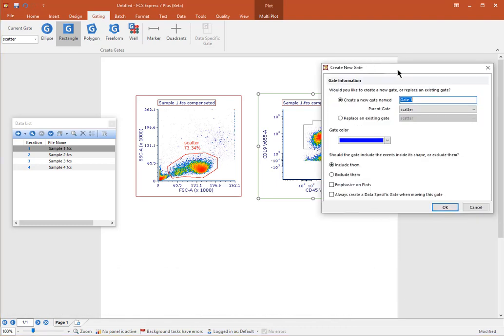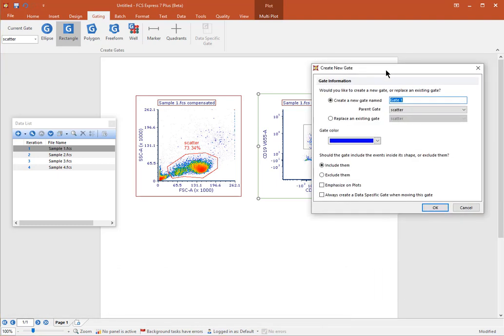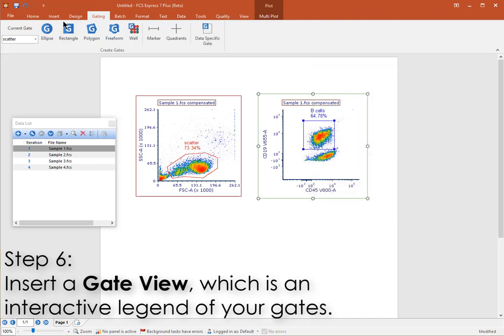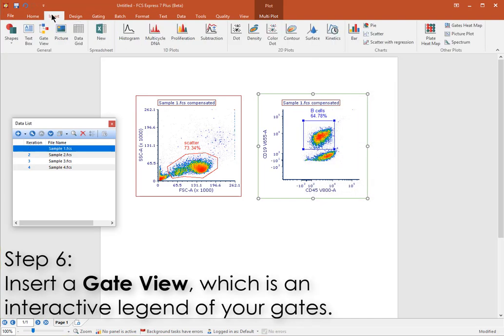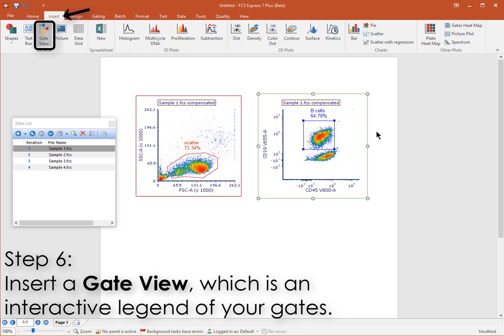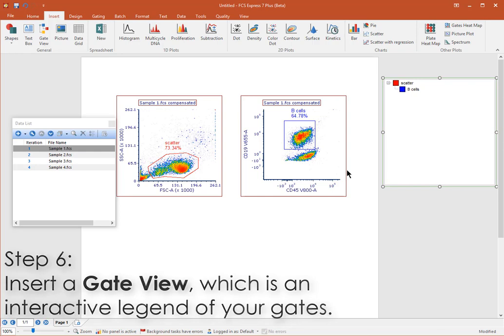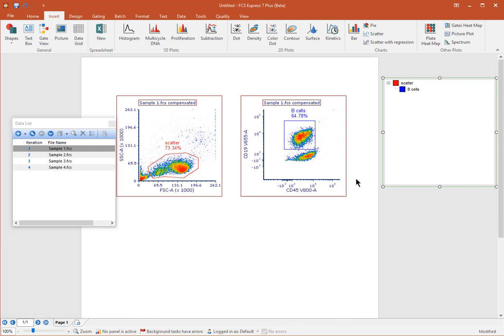Now that you have a few gates, you'll want to view an interactive legend of your gates. From the Insert tab, choose Gate View. Click on an empty spot on your layout to insert the object. From the Gate View, you can redefine your gating hierarchy, delete or rename gates, and more. You can also drag and drop gates from here to any plot to re-gate that plot.